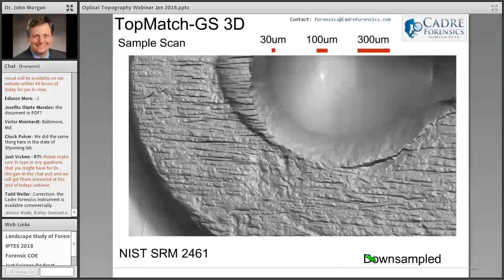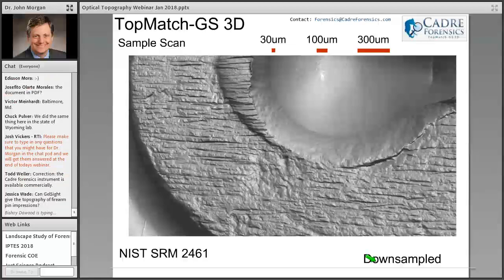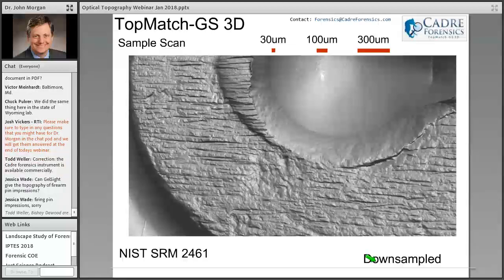But one of the things that's interesting is that they have taken the data from the Nanofocus system. That's the basis of the Brass Tracks, and they've put it into their system, imported it using a data exchange standard, and been able to show that they can come up with the same kind of matching as it would be if it were under an IBIS workstation.